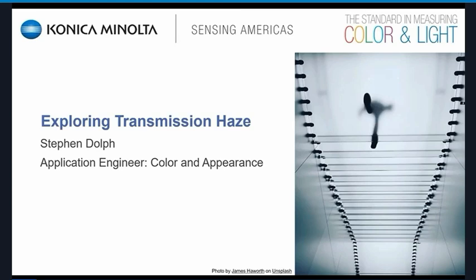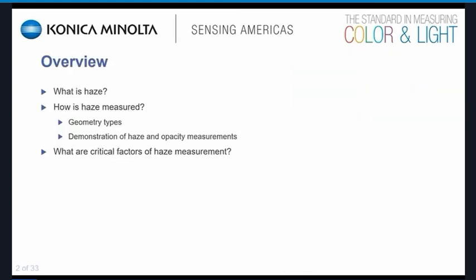Today we will focus on transmission haze. To give an overview, I'll define and give some example applications of haze and explain how its measurement is useful. Also distinguish haze from a few commonly confused terms. Then we'll talk about how haze is measured and give a demonstration. And I'll end with a discussion of how we can achieve good repeatability and reproducibility and good measurement agreement.